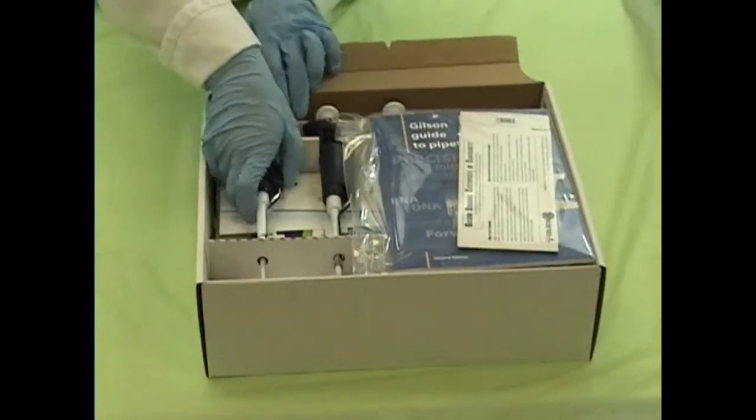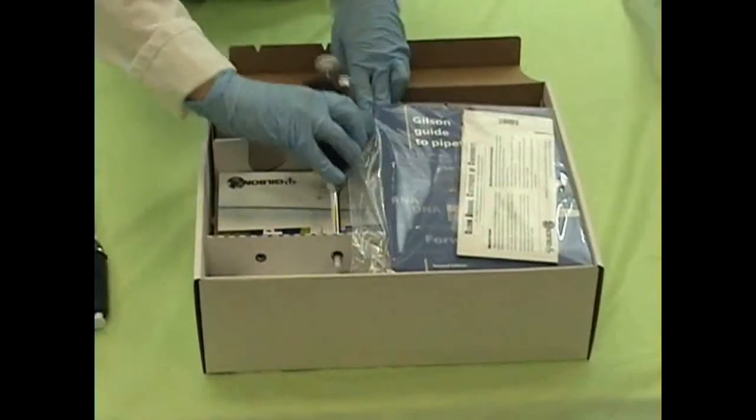Each starter kit contains three Pipetman Neo pipettes and certified quality boxes and gels and tips.